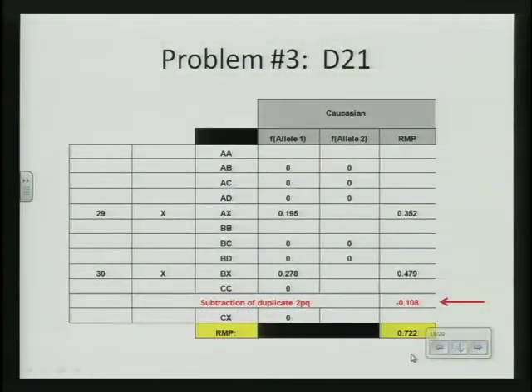So I think we started with D21 as one of the options. And so I'm just going straight to this section of our spreadsheet. I kind of do a shorthand to get to this. But basically at this point where we're at, you've got a peak at 107, one at 281. There can be potential dropout with either of these peaks.